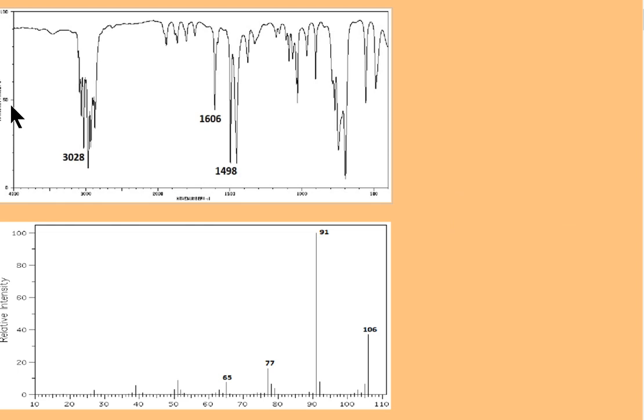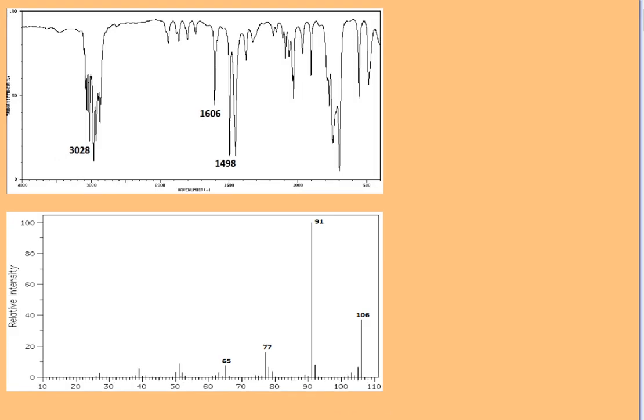Let's look at our last problem, which also has 3 distinctive peaks. Again, if you want at home, take a look and see if you can work out the spectral analysis for yourself before we look at the answer.